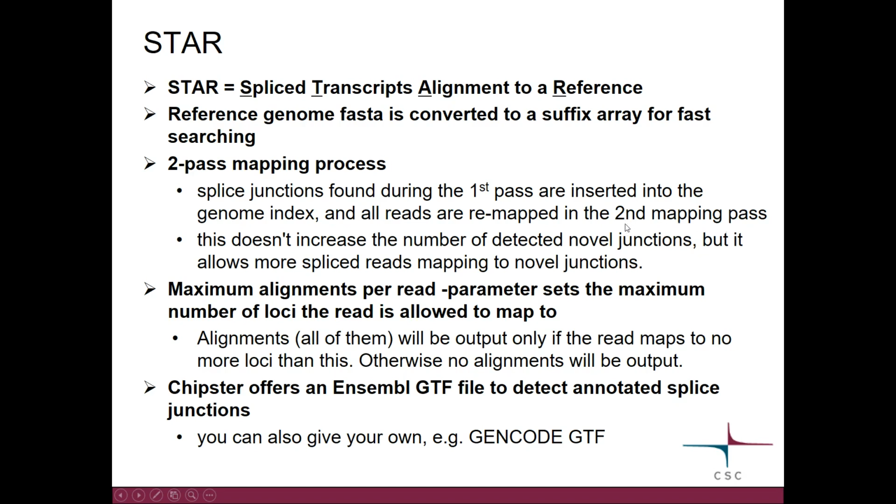So this approach, while it doesn't actually increase the number of new splice junctions, it allows more spliced reads to map to these novel junctions.